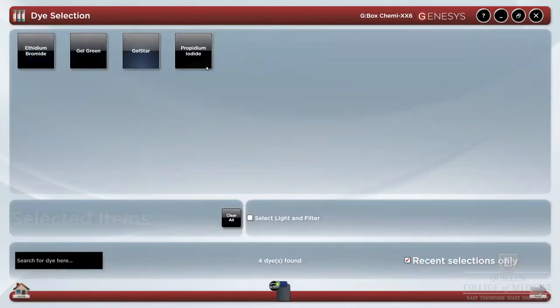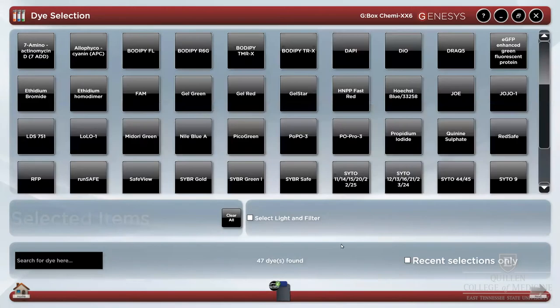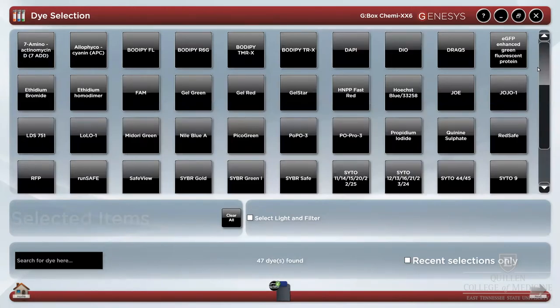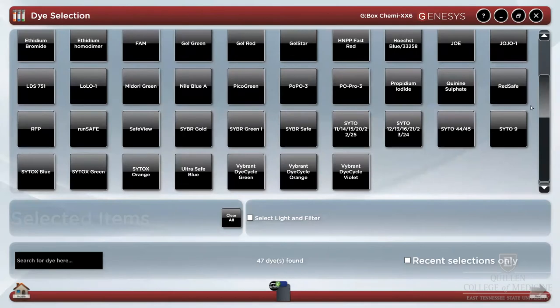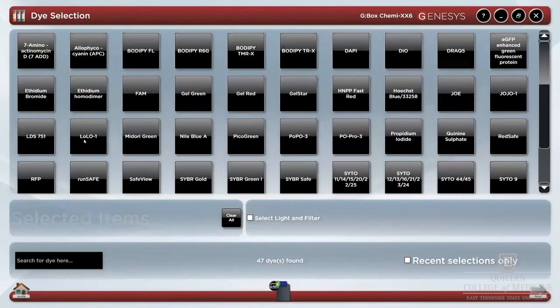For example, agarose gels allow use of ethidium bromide, gel green, gel star, propidium iodide, and more. Deselect the recent selections option to the bottom right to see all possible options on our instrument.